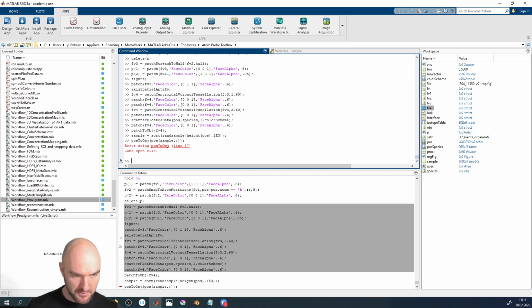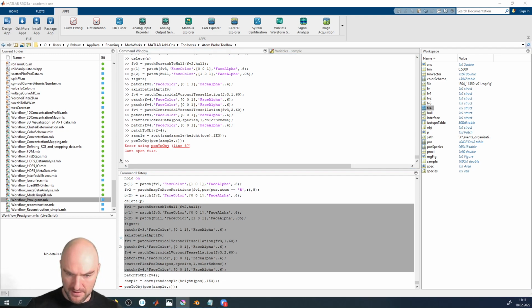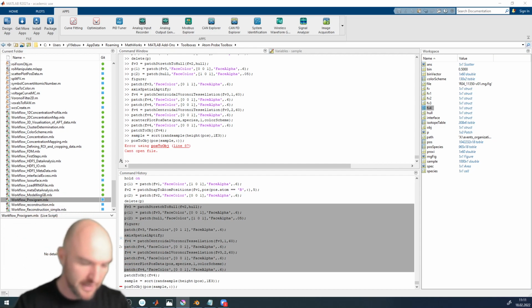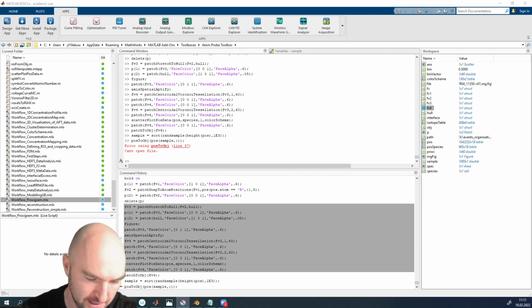Let me maybe visualize that. Essentially what we're doing is we're creating histograms. We're chopping up our data set into blocks. And if we do a voxelization in 3D, what we're actually doing is, we have our data set here.